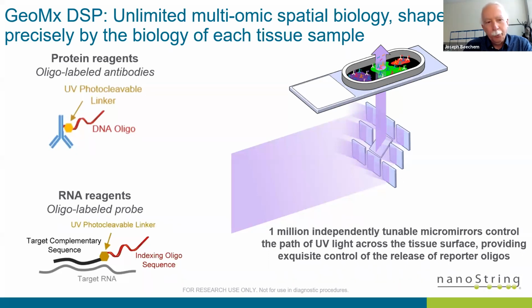These are fish probes. We're looking at about 18,500 fish probes in space. All those fish probes have little photocleavable linkers. When I go into an organ and want to measure a whole transcriptome around a particular region, the mirrors that you see on your right will adapt to a single cell resolution the shape of that unit inside that organ that I want to measure. You'll shine light on just that part of the organ.